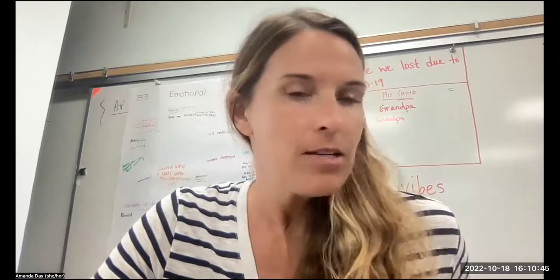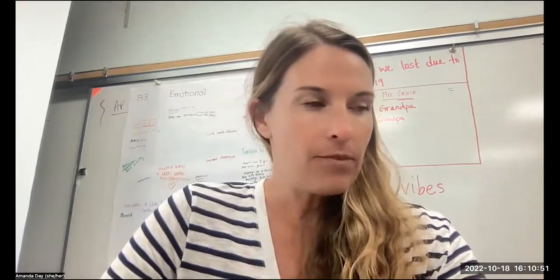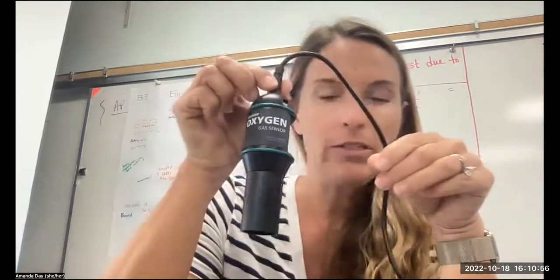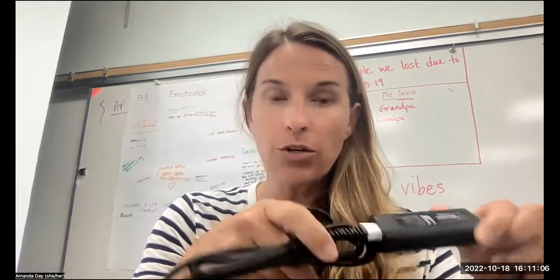Hi. So for our lab, we are going to be using Vernier sensors. And for this lab, we're going to be using an oxygen sensor. This is what it looks like. It is going to need to be connected to another device. It's called a Go Link because we don't have that kind of connection on most of our computers.